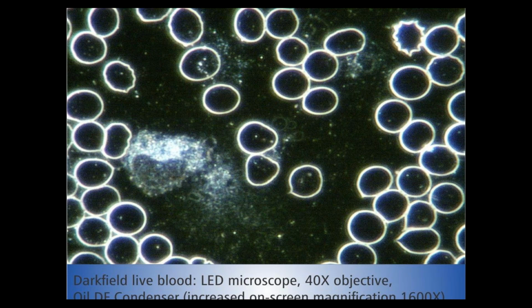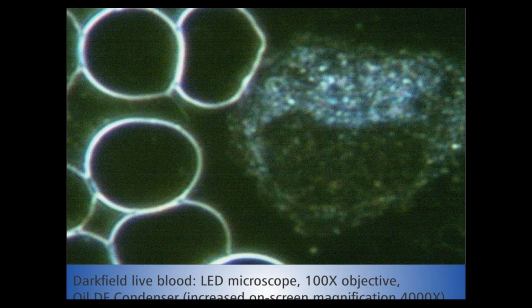And then finally, if you were to increase the magnification to the maximum level using the 100 times objective, you would then get this image. So you can really see how close you are getting to this. Wow, you can really see the difference that the additional magnification makes, can't you?